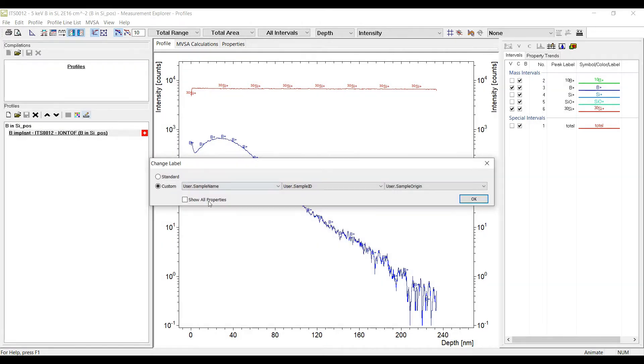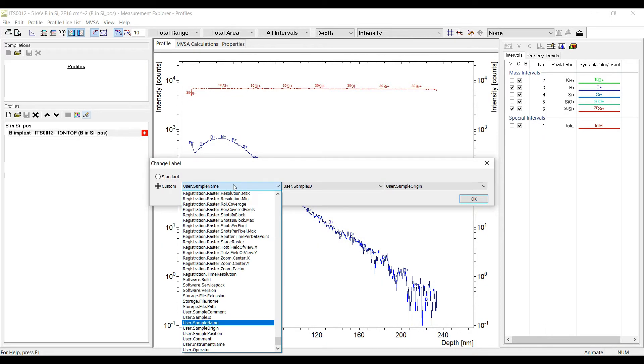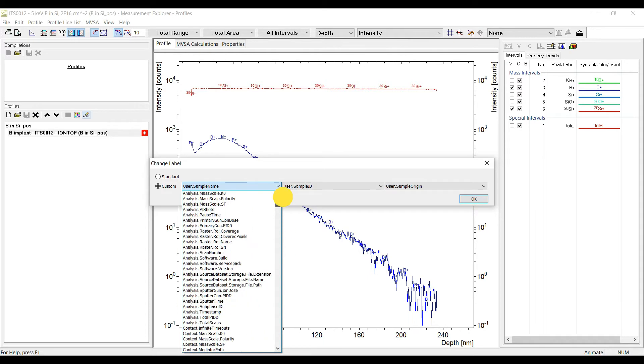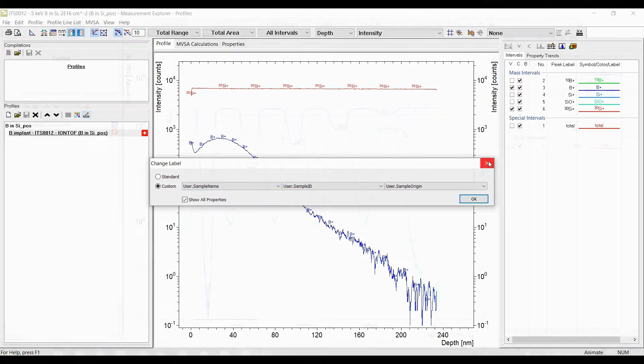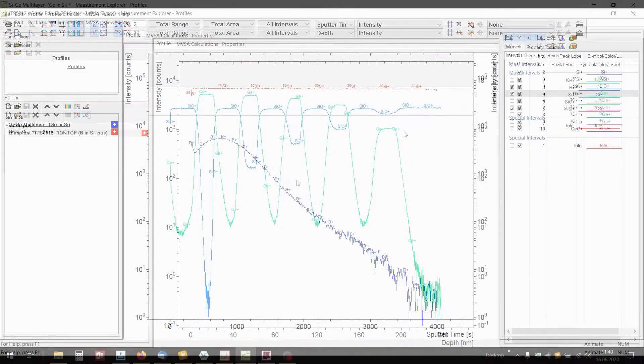If you enable the show all properties checkbox you can select from every property of the measurement like sputter energy, temperature and so on.